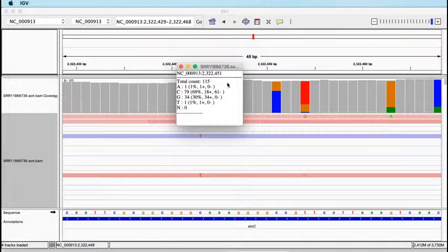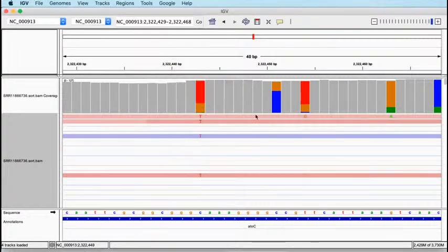In this case, most of the reads still support the same base as the reference genome, but there's enough discrepancy for IGV to highlight it and show us that there are some discrepancies at this position. It does that by coloring in the coverage bar like this. It's colored in predominantly blue because most of the bases are blue. Then you get this little stacked bar chart view of that particular base.